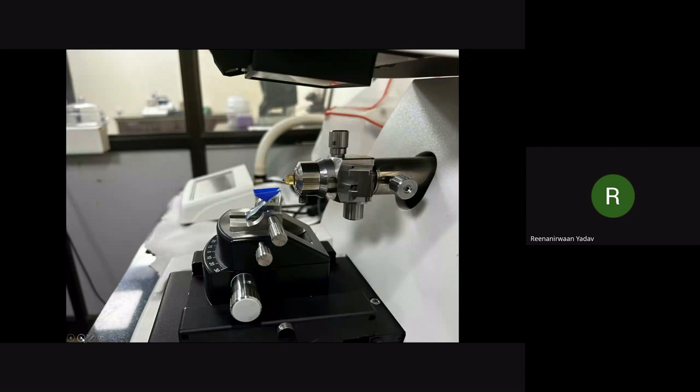So this is the alignment. Here we have our cutting arm or our lever which is holding our sample. Below that we have a glass knife attached with the boat. By moving this along the edge of the glass knife, we can get our thin section.